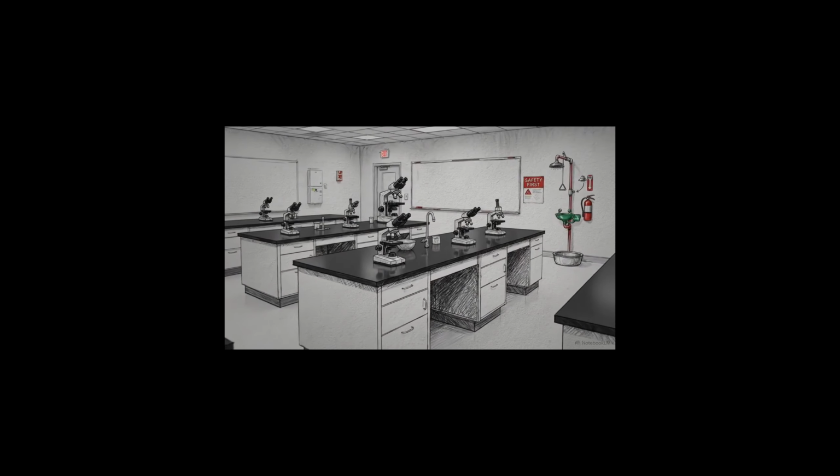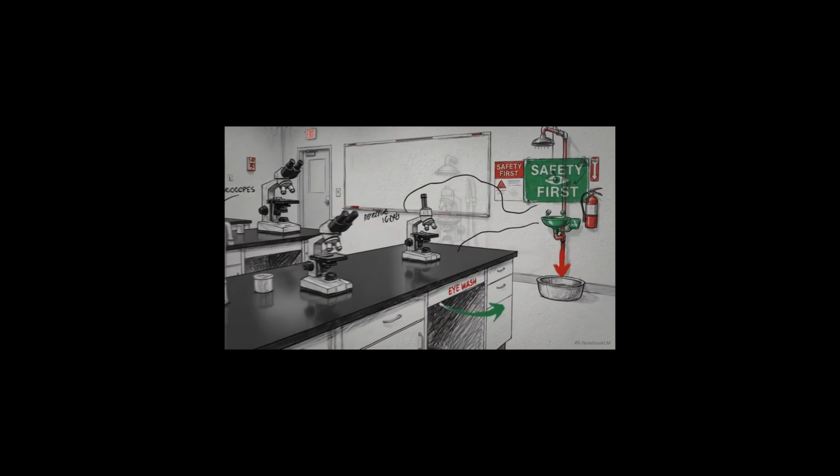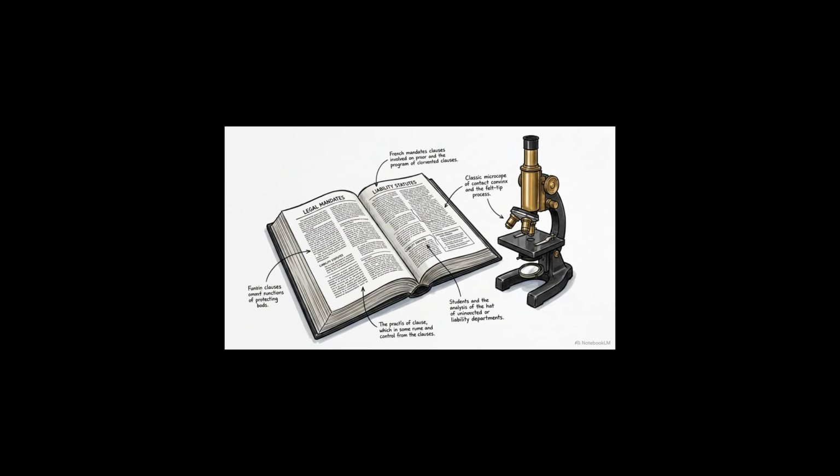Welcome to the science classroom. As an instructor, your primary professional obligation is to maintain what we call a sanctuary of discovery. This means taking proactive steps to prevent foreseeable harm before an experiment even begins. This obligation is rooted in a legal concept known as the duty of care.